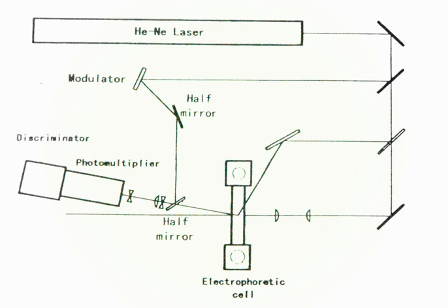Topic: Biophysics. ELS is useful for characterizing information about the surface of proteins. Ware and Flygare, 1971, demonstrated that electrophoretic techniques can be combined with laser beat spectroscopy in order to simultaneously determine the electrophoretic mobility and diffusion coefficient of bovine serum albumin.